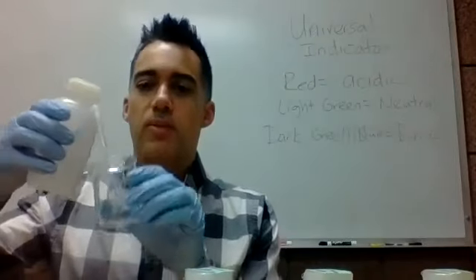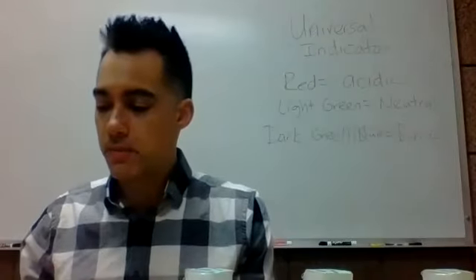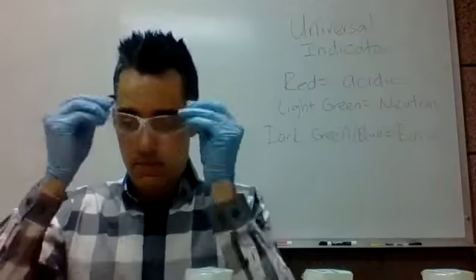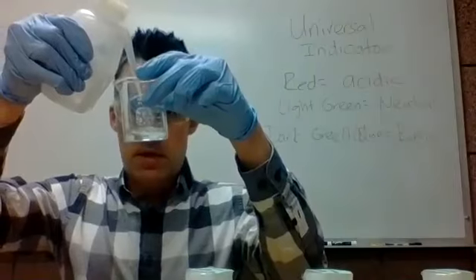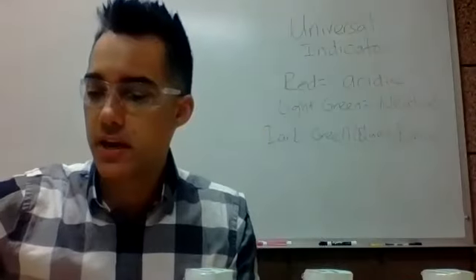So just to start off, I'm going to add a little bit of deionized water. Maybe I'll put on my safety glasses. A little deionized water into a beaker, and I'll add the universal indicator to it.